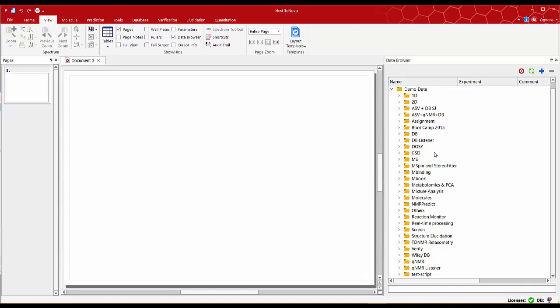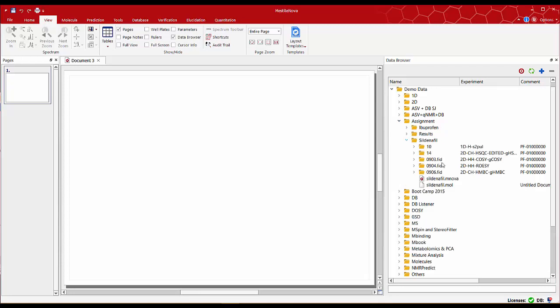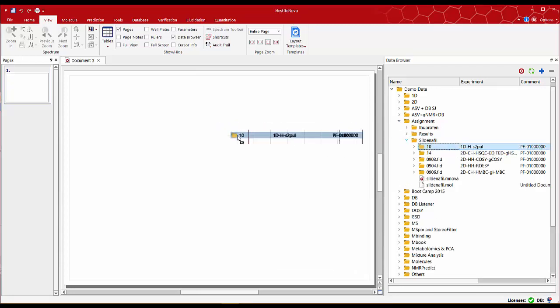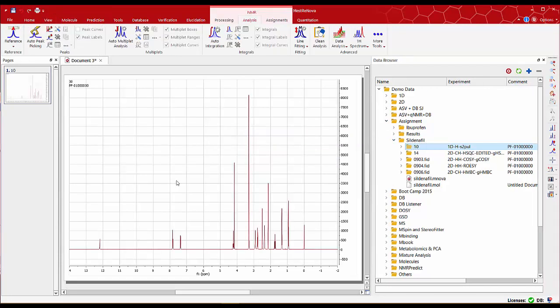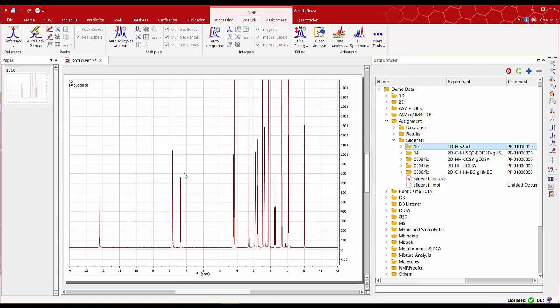So on the data browser let's open the proton spectrum and drag the folder with the raw data into MNOVA. The spectrum is automatically processed.